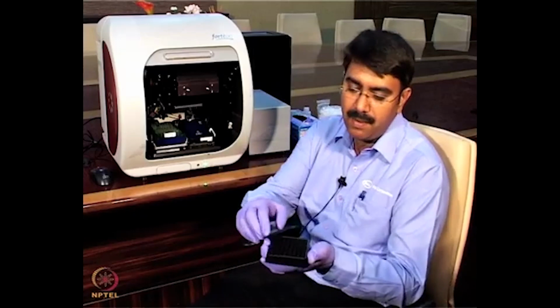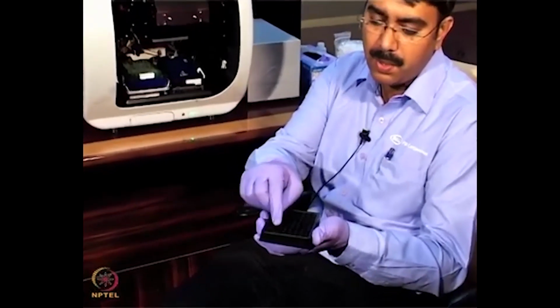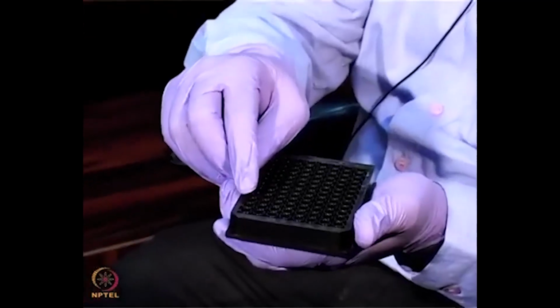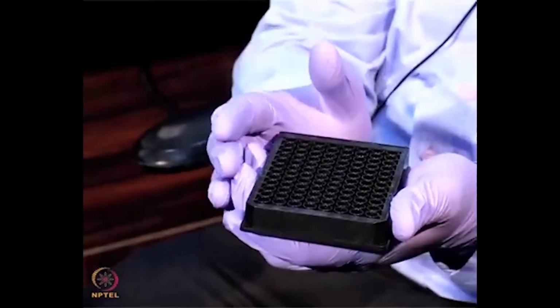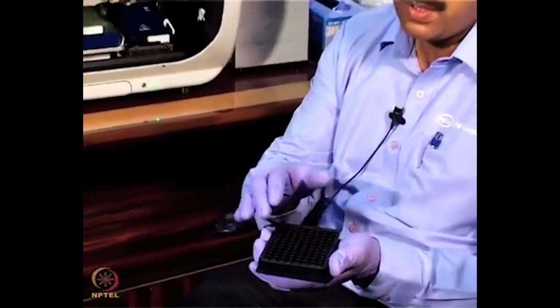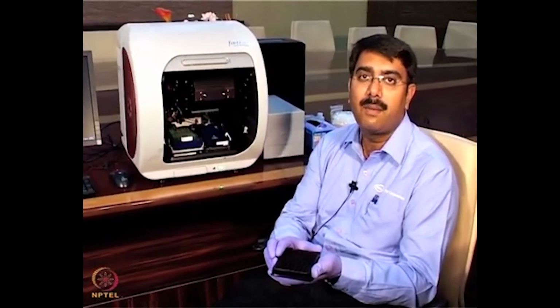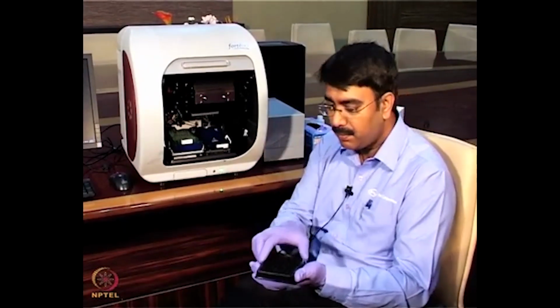This is the plate map here. The first column is the buffer. In the second column I am going to put the 10 microgram per ml concentration of biotinylated protein A, and in the third column I am going to put buffer. It will be useful so that the unbound biotinylated protein A gets washed off here, and this well will also be useful for the dissociation step. And in the last wells I am going to put the analyte, the 25 microgram per ml serially diluted in all these 6 wells.